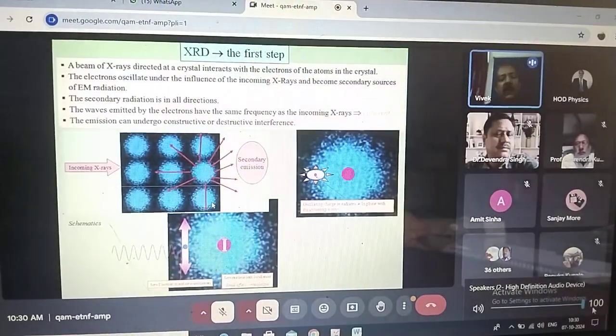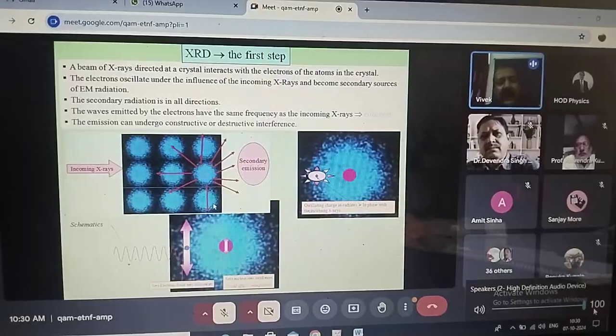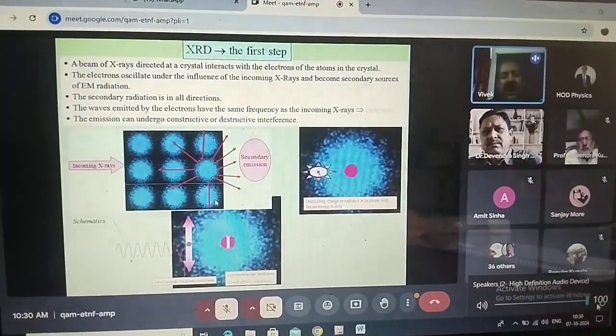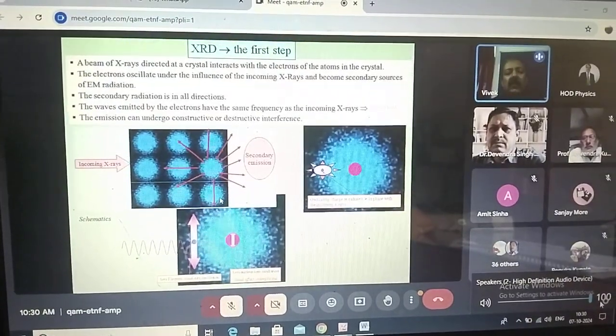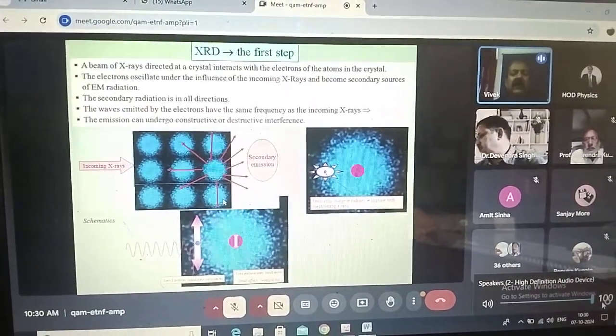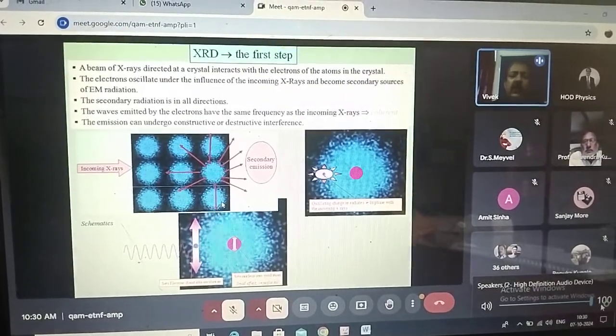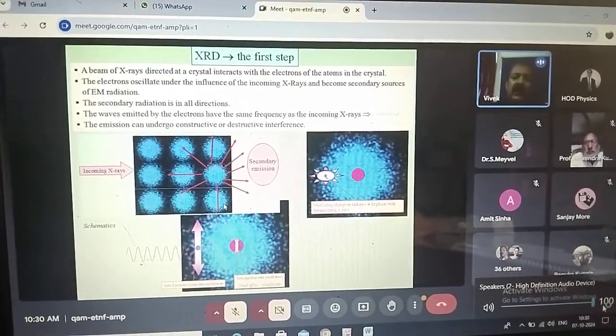We cannot talk of any kind of microscope here. So it is that indirect way of elucidating the structure, how atoms and ions are sitting in a particular molecule. That's why a lot of mathematics is involved in it. If a student has to do the complete work of a structure, it will take months.